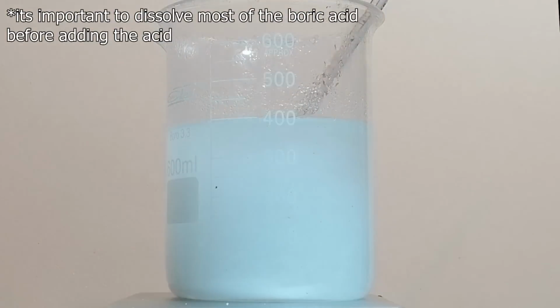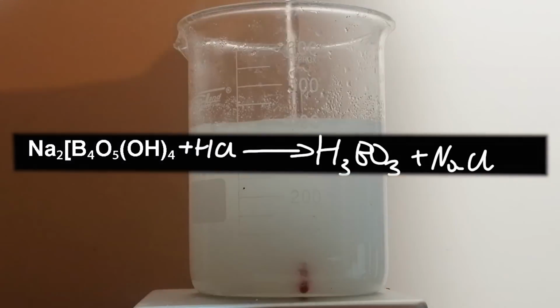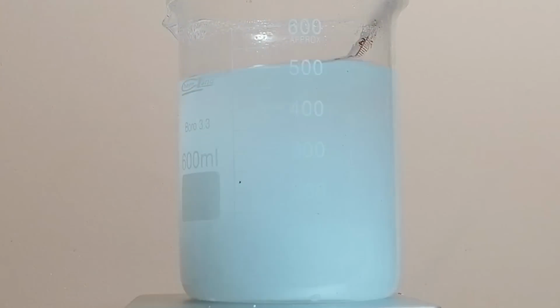What's happening here is that hydrochloric acid is a strong acid, and as we all know, the stronger acid brings out the weaker one, and thus boric acid is formed along with sodium chloride. Boric acid is much less soluble in water than borax, and thus it will start to precipitate out. In fact, as soon as I've added it, some boric acid crystals already started appearing.